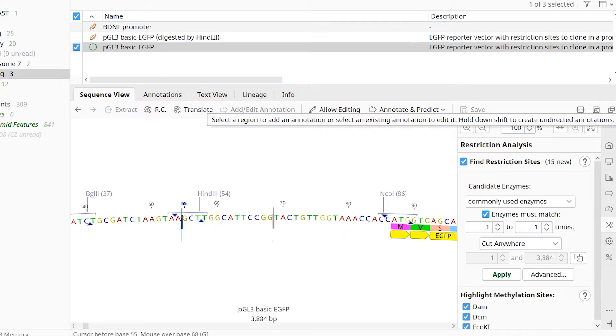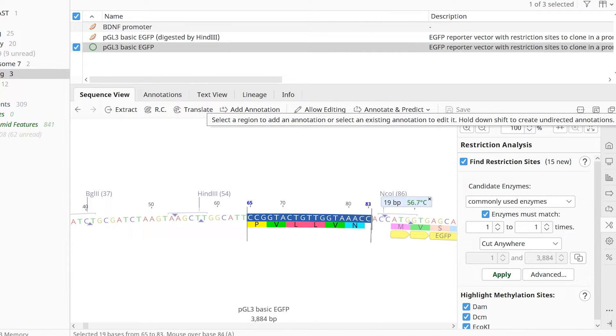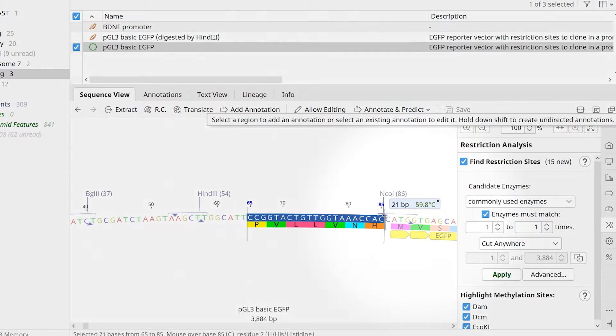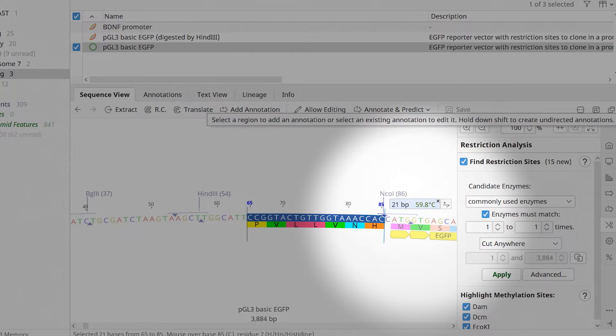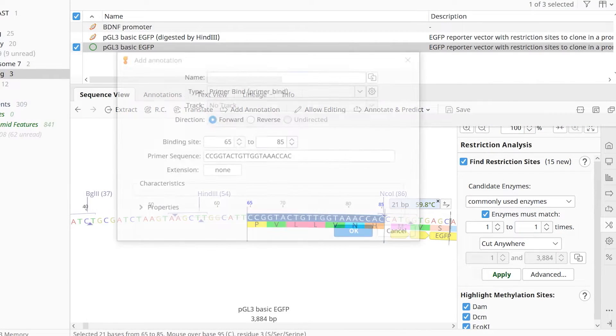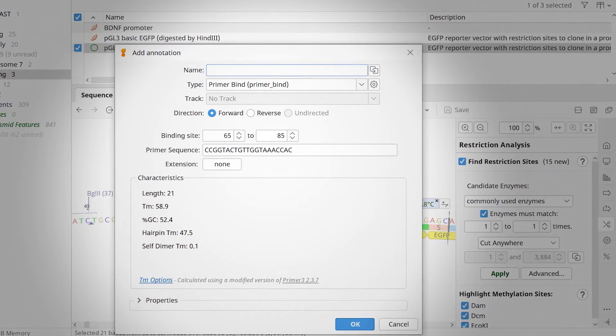Simply click and drag on the sequence from left to right at the desired site to add a forward primer. Aim for a primer size of around 20 nucleotides and a melting temperature of approximately 60 degrees Celsius. To add the primer, select Add Primer.